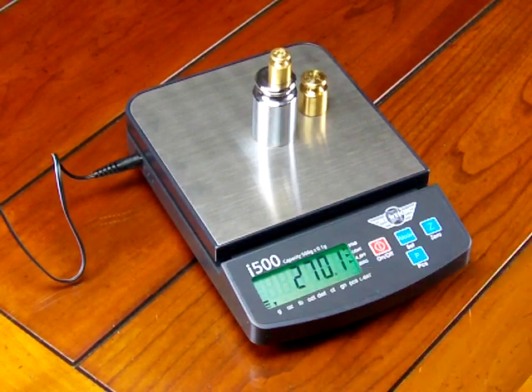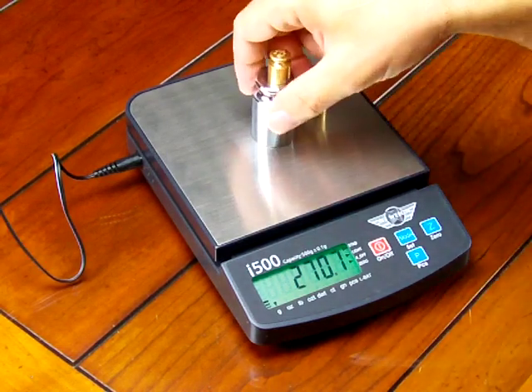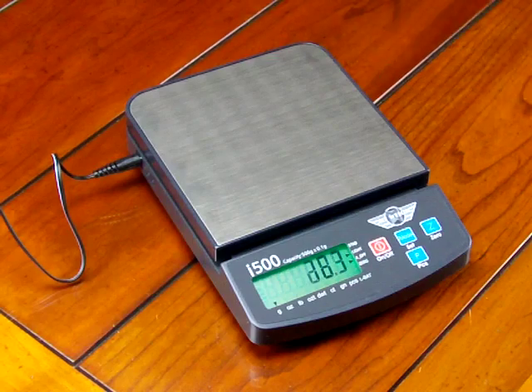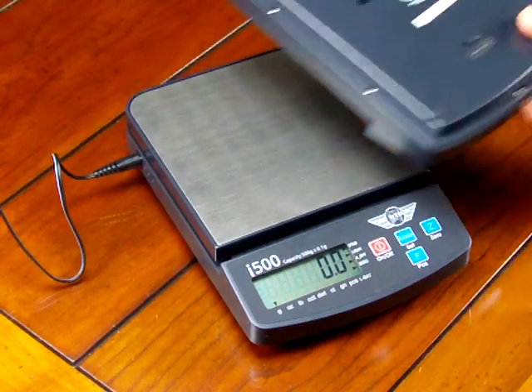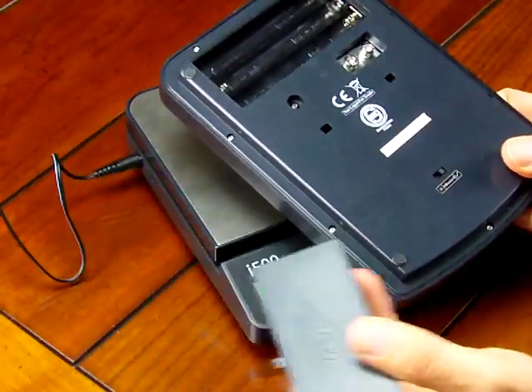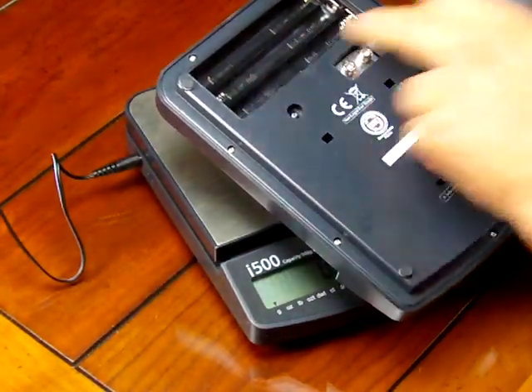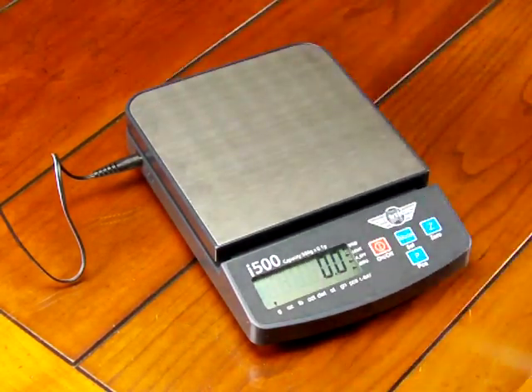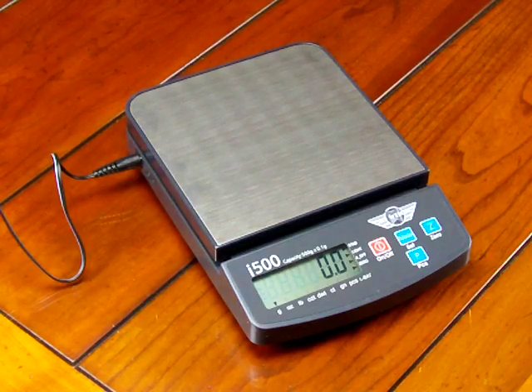That's a nice feature that a lot of competitor scales on the market do not offer. This scale operates off of an AC adapter or batteries. On the bottom of the scale, you can see we can use six AA batteries. The scale does come standard with the AC adapter — that's a nice feature also.